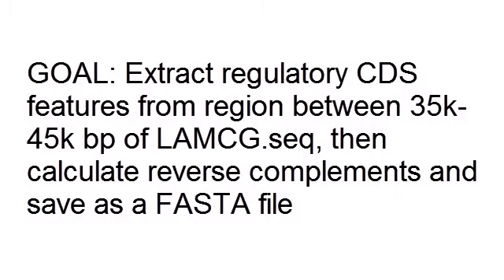In this example, I want to extract all regulatory CDS features from a subset of a sequence, and then automatically calculate the reverse complements.